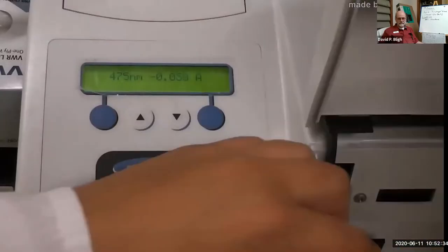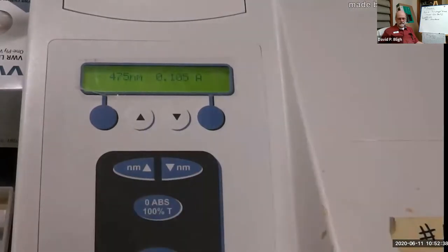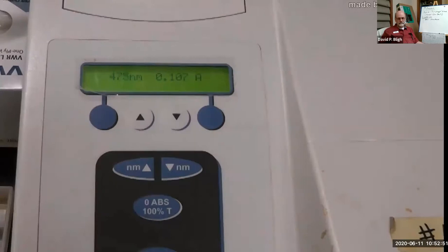Once you've inserted the cuvette with your sample, simply close the door. Do not adjust any settings. All you need to do is wait for the reading to stabilize. The reading, as you can see, is right there. Here it finally stabilizes at 0.107. Remember, absorbance does not have units. And there you have it, the basics of a spectrophotometer. Good luck and have fun!